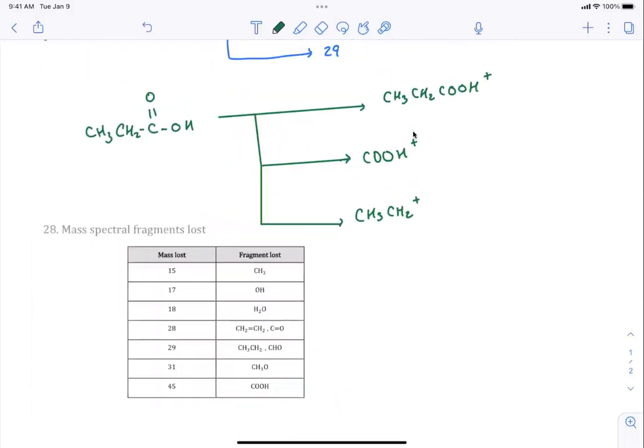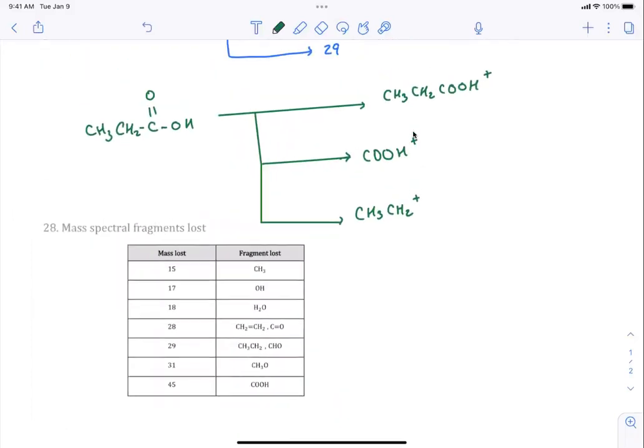And so you notice here, for example, this molecule here, this is propanoic acid, and it's 36, 42, so 74 grams per mole. Okay. In this structure, you would see a peak at 74, and you'd also see a peak at 45, and you'd see a peak at 29. Now, the height of the peak really isn't that important for us right now. The height of the peak tells you how stable the fragment is, but that's really not a huge concern of ours right now.